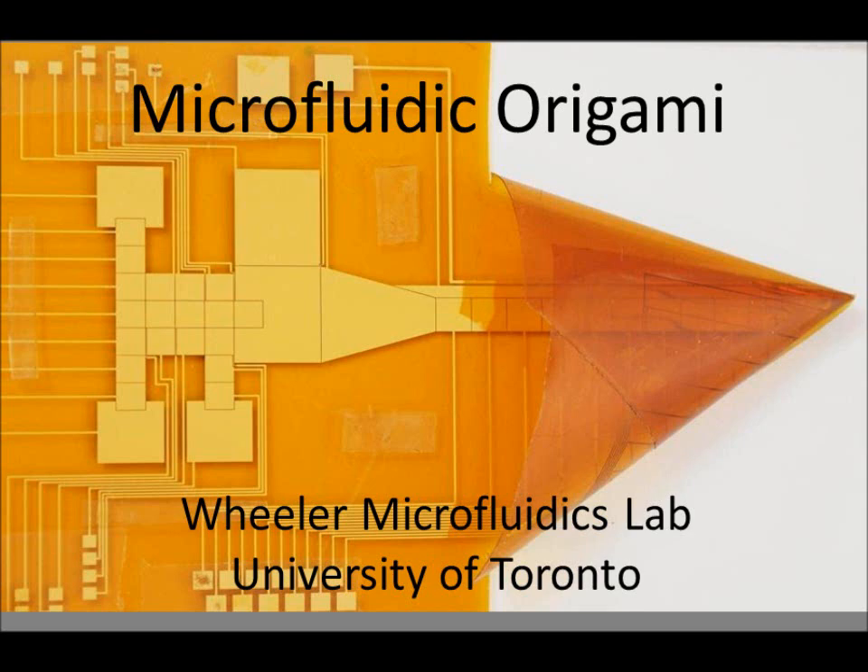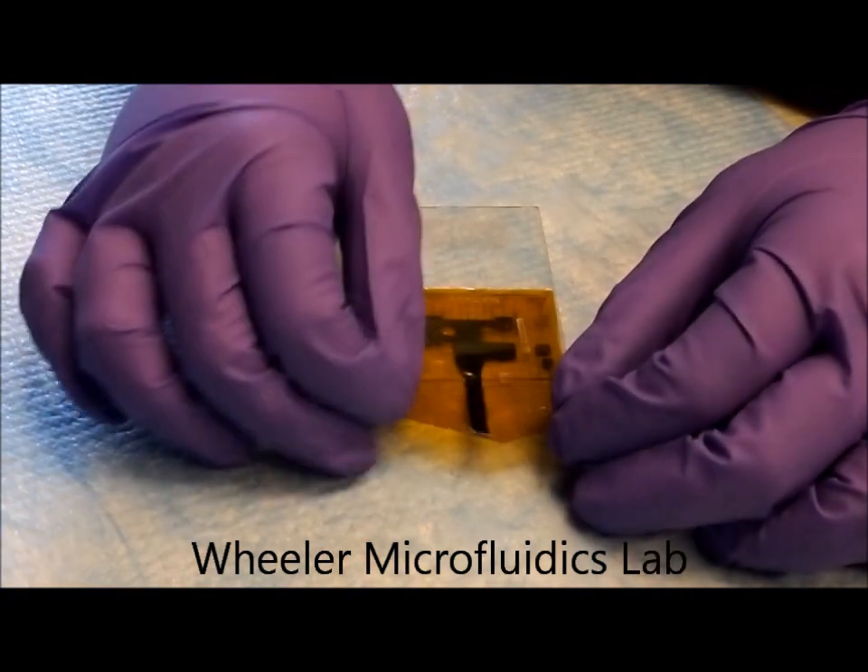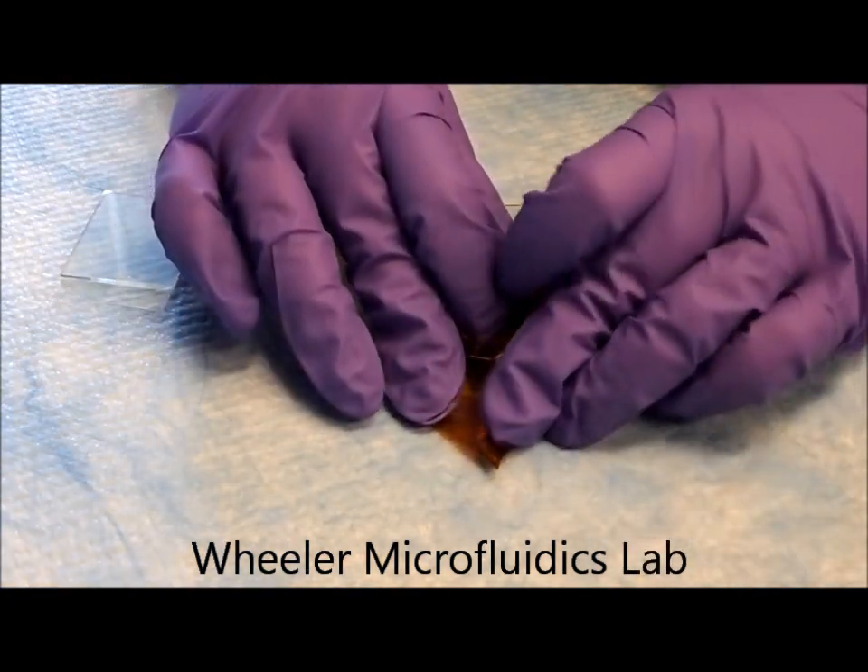In the Wheeler Microfluidics Lab at the University of Toronto, we've developed microfluidic origami, a new technique to make digital microfluidic devices with an integrated mass spectrometry emitter from a flexible film.